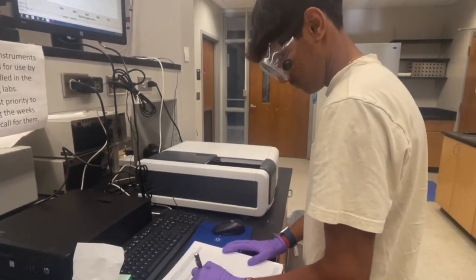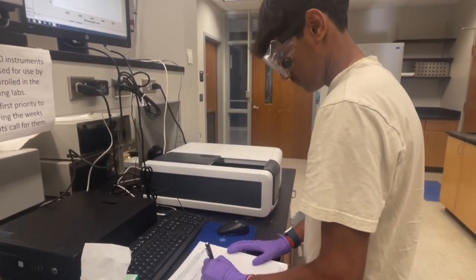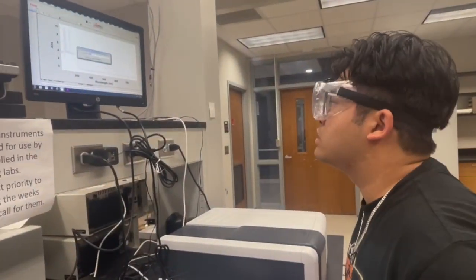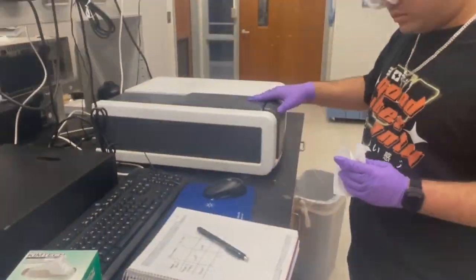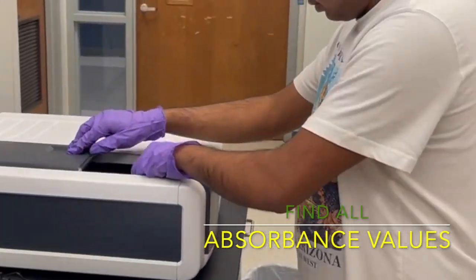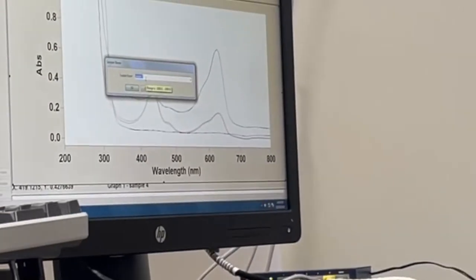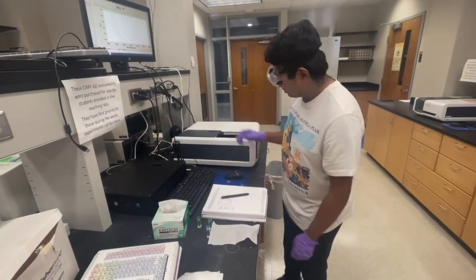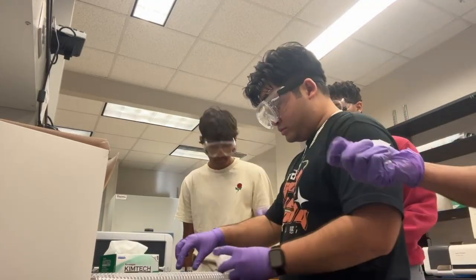Lambda max is the wavelength at which a substance absorbs photons the most strongly. It is the highest point on the y-axis of an ultraviolet visible spectrum. You scan across all wavelengths to find the lambda max as well. Make sure you clean up your station before moving on.